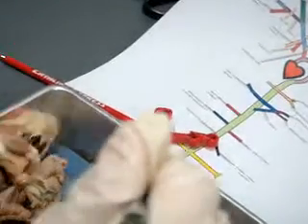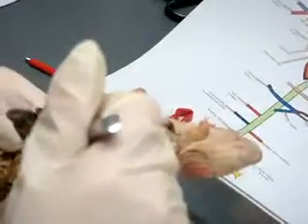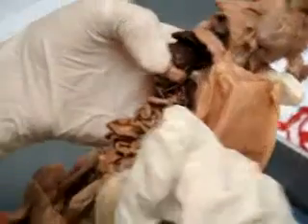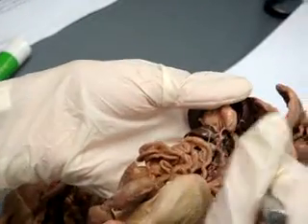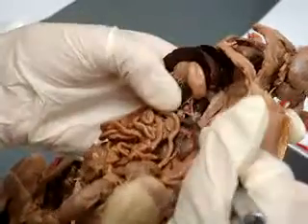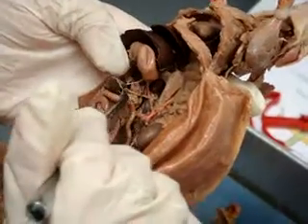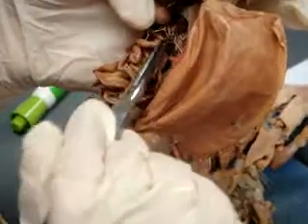So there's that celiac. Let's see how your celiac is. There's another celiac. Okay. So, looking for the three branches of the celiac, you have one which goes to the stomach. Follow it all the way through right there. See how that goes straight to the stomach? That's your gastric. You have two which branches right here and goes directly over your spleen. That's your splenic or your splenic artery, depending on which package you read. And you have a third one back here.